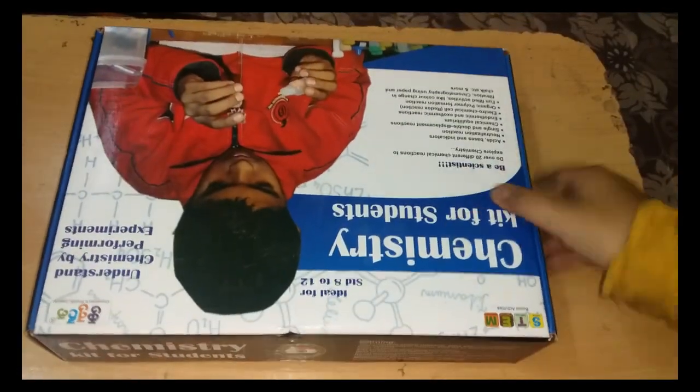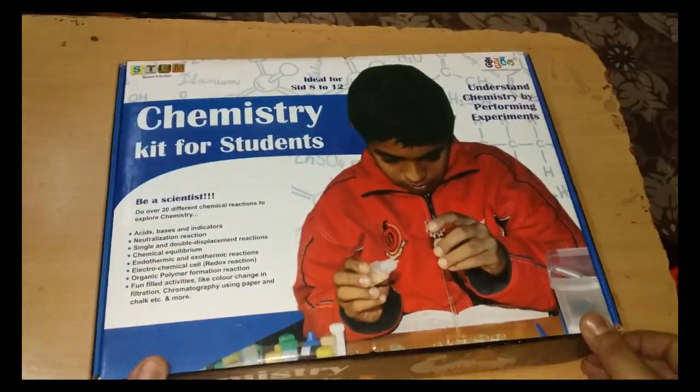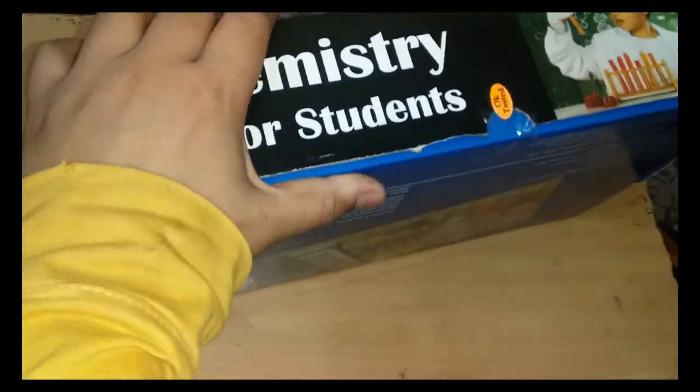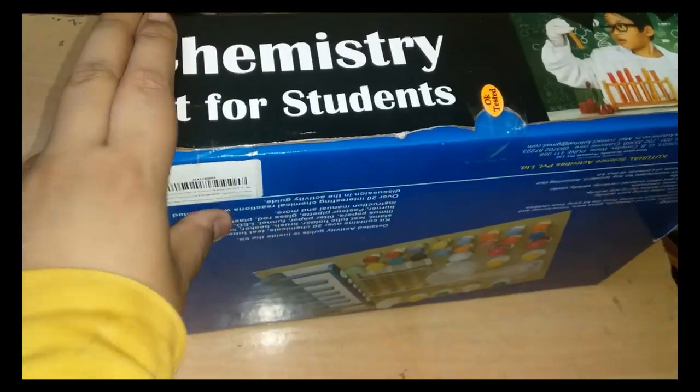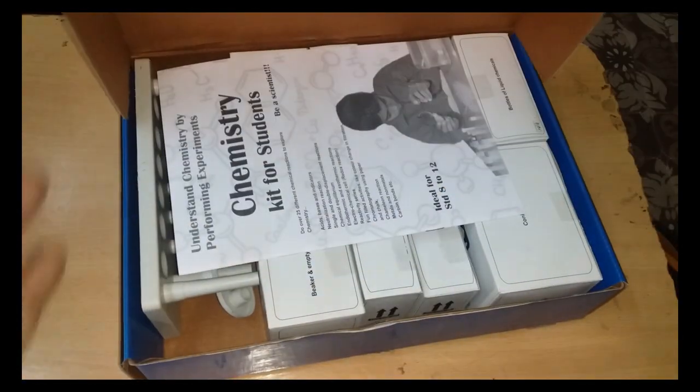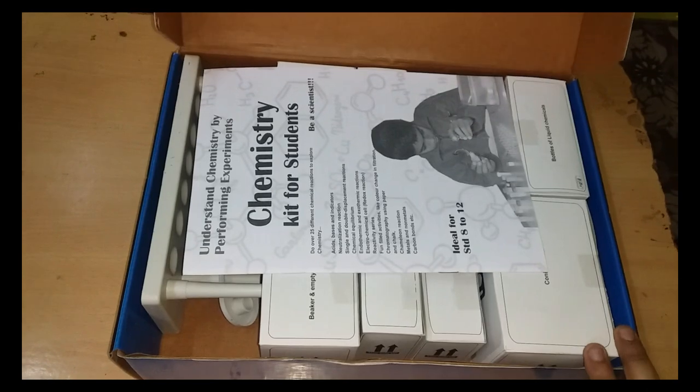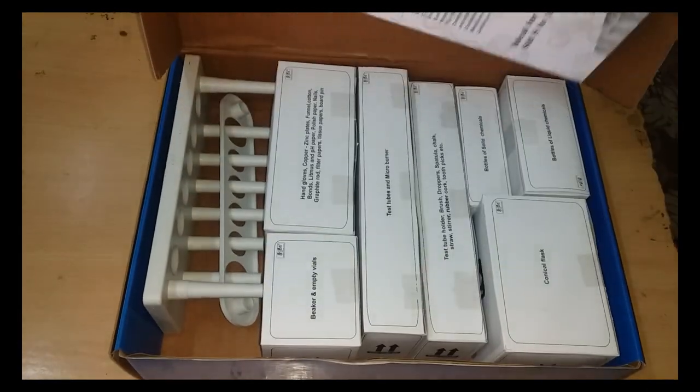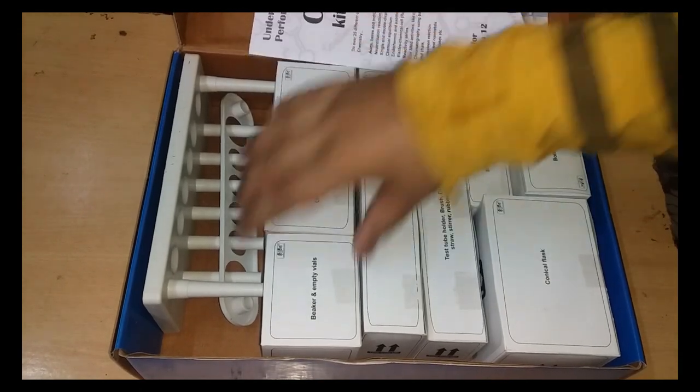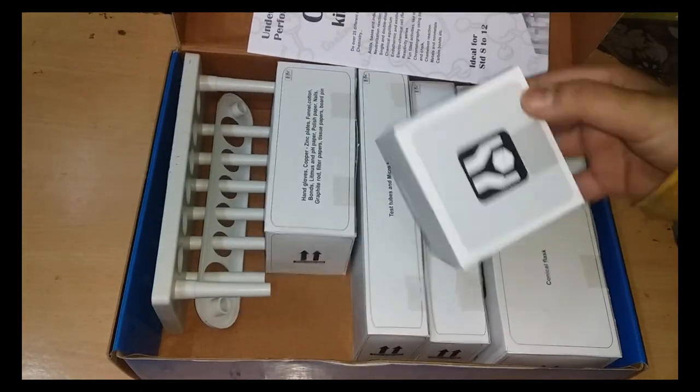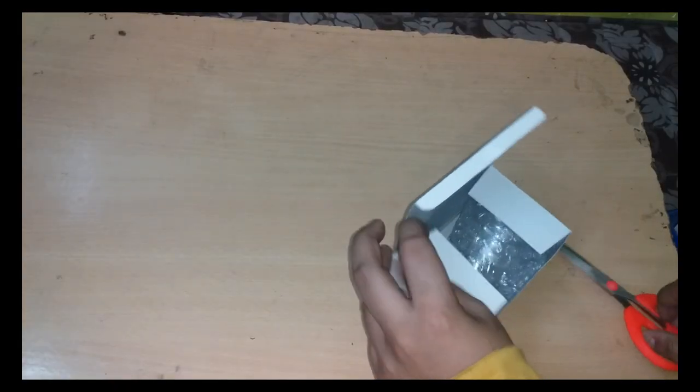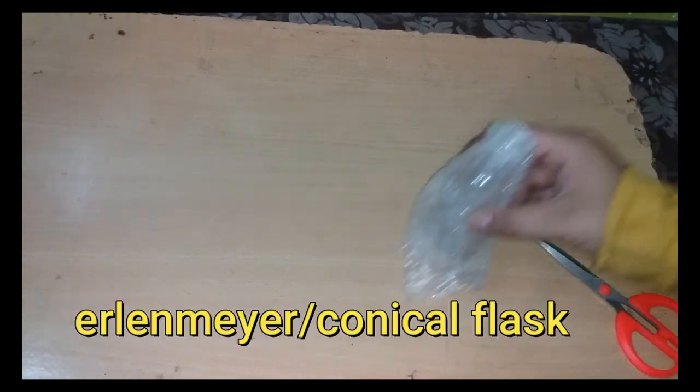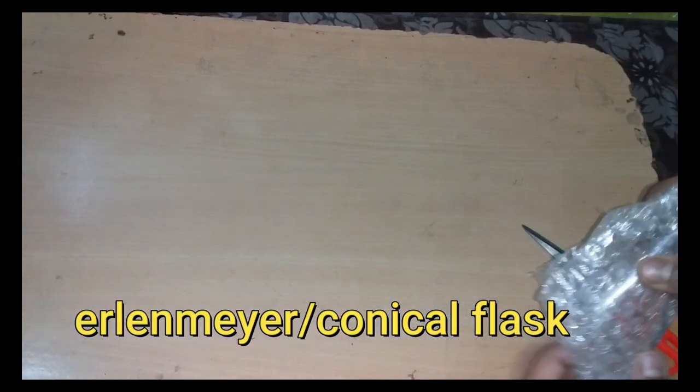So you know it took a million years to unbox. Now this is the chemistry kit, the grand new brand new chemistry kit for me. Wow, this is the chemistry kit for students, a guide, and some packets. There are one, two, three, four, five, six, seven, eight, nine packets, and this is an Erlenmeyer conical flask.